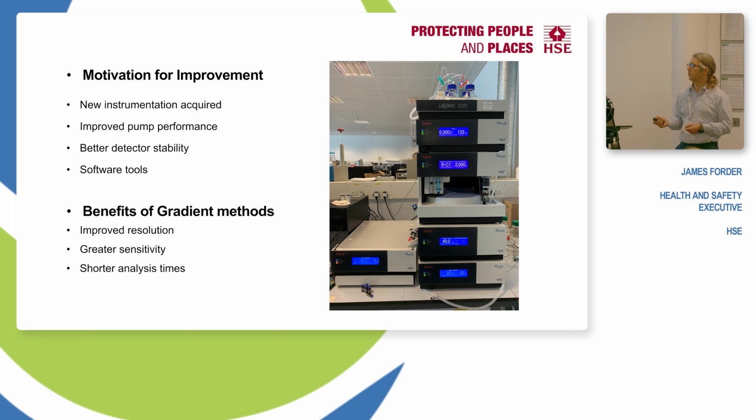So the initial challenge: first of all, I need to check that it's safe to do this. On this gradient, I don't want to destroy my detector by blocking it, which we did a lot in the development of the isocratic method. Installing the isocratic method on this instrument, transferring the method from the old instrument to this new instrument in cooperation with the instrument manufacturer, we actually broke a lot of detectors. So we learned a lot about how to compare the mobile phase.